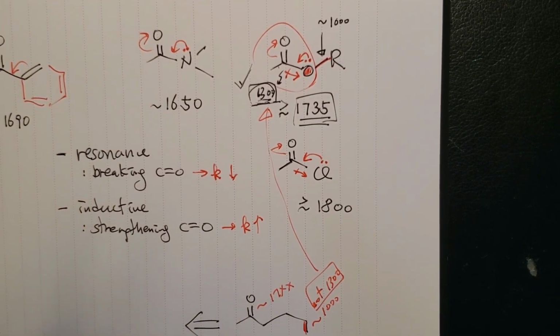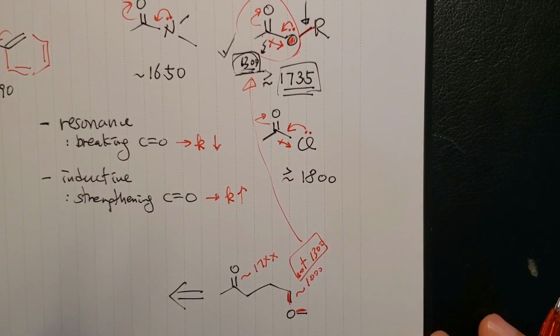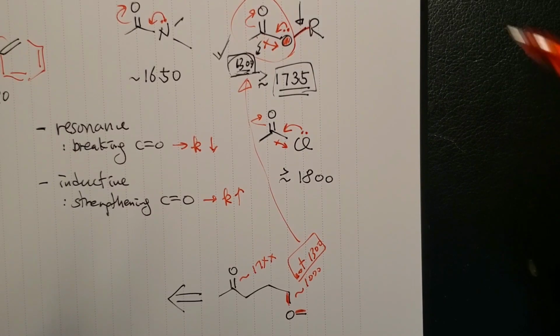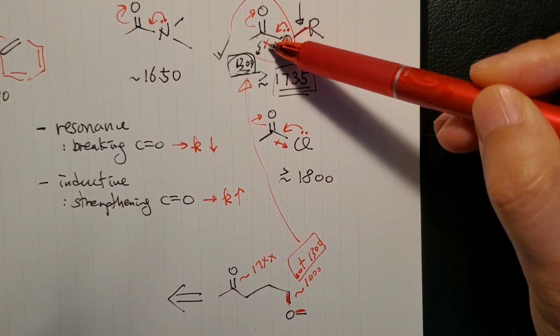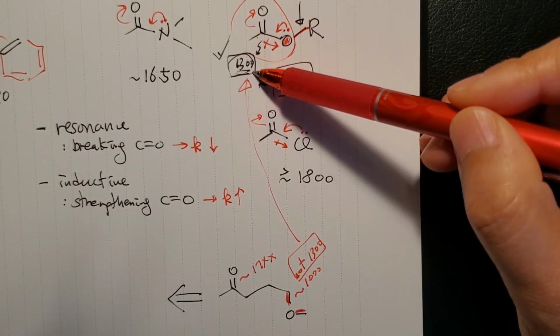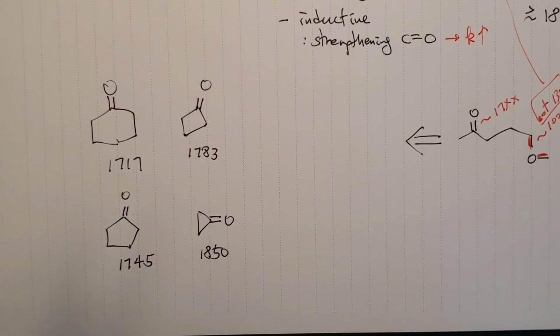So when you remember how to distinguish them, the different number for the carbonyl is the first step. But when you confirm, you do as much as you can with more confirmation. In this case, for the ester, you have to look for this peak. And if you have other spectra, NMR, mass, you want to check with them as well. This also is true for the ester.